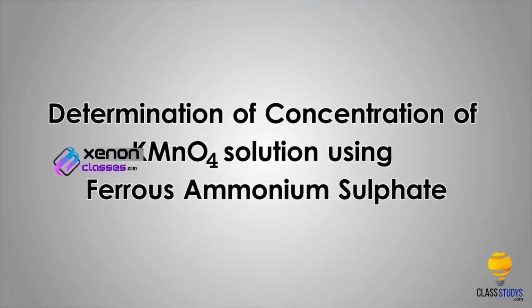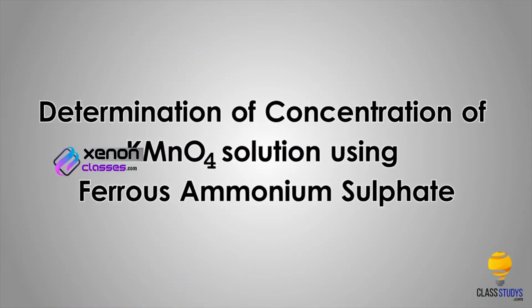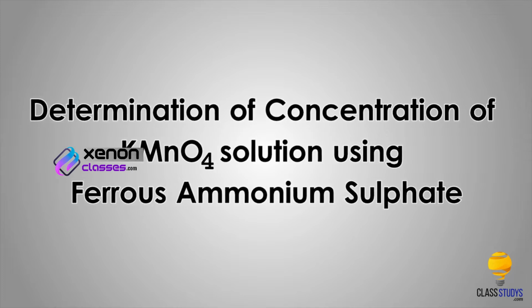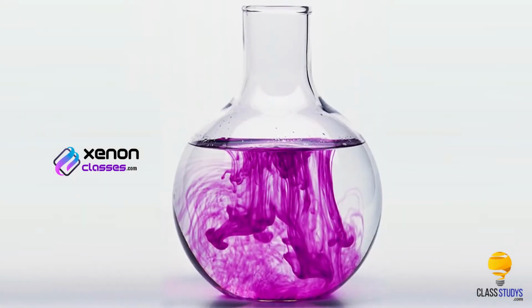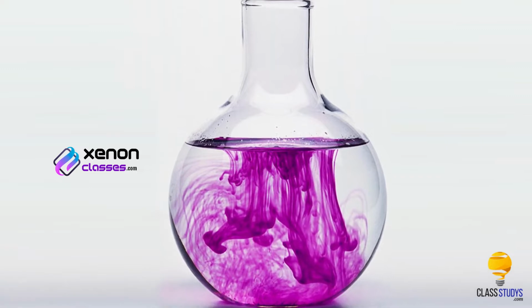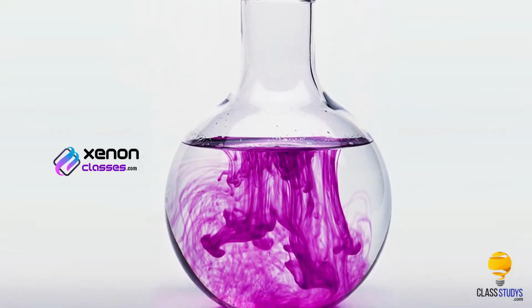Determination of concentration of KMnO4 solution using ferrous ammonium sulphate. The process of titration is used to determine the strength of a given solution of potassium permanganate.